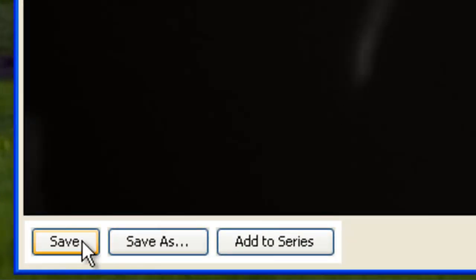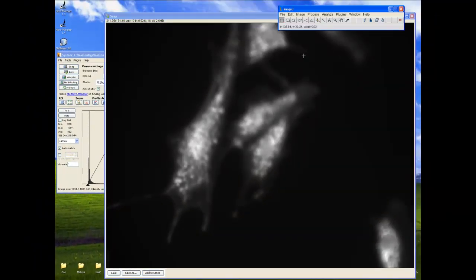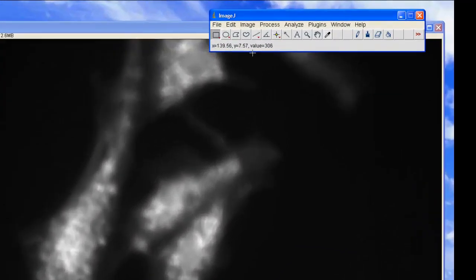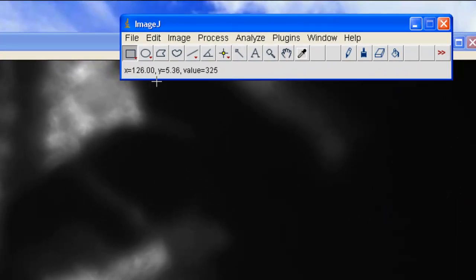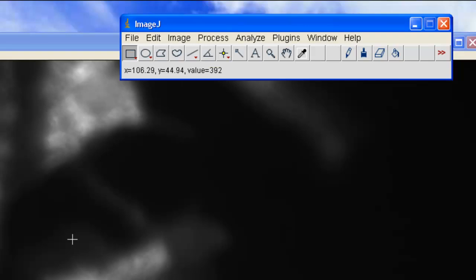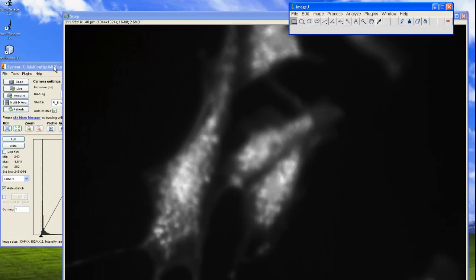See how you can save, save as, or add to series. We can also see the pixel values with the pixel's x and y position on the ImageJ window. Of course, all of the image analysis options on ImageJ are available for use as well.